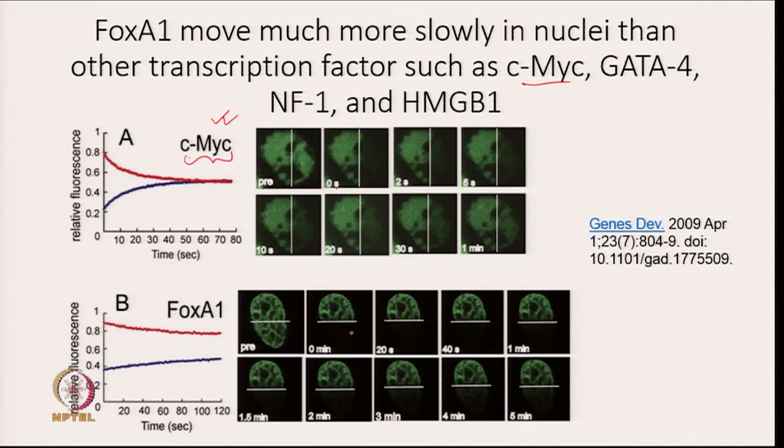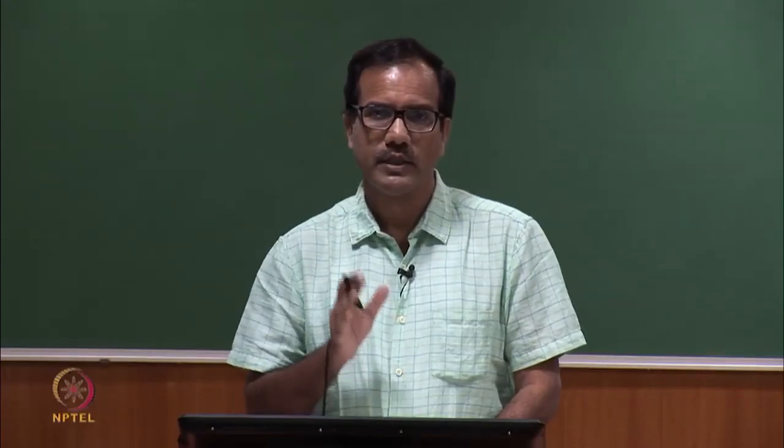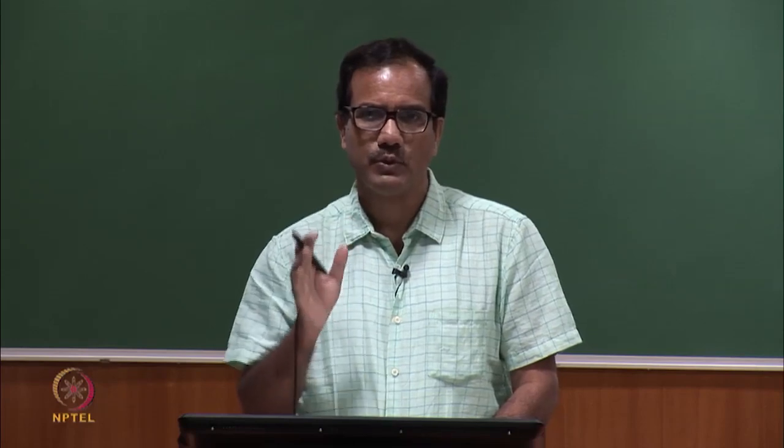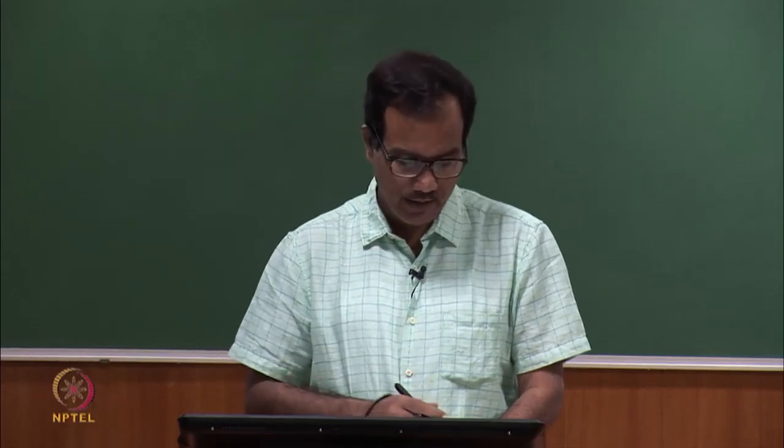This half part is bleached at 0 minutes, and now 20 seconds, 40 seconds, 1 minute, 1.5, 2, 3, 4, 5 minutes. You can see that in this we started looking at the recovered color at 20 seconds, whereas till 4 minutes you are not seeing anything for FOXA1. What does that mean is that FOXA1 moves much more slowly in nuclei than transcription factors such as c-Myc.